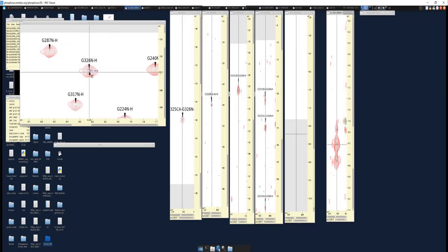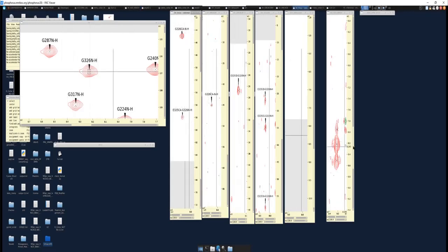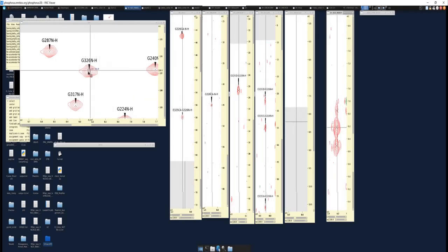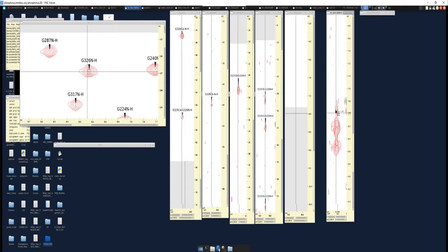So in this scenario, we have a glycine, and we can just see this from the HNCA. And we can see we have 3 peaks in the amide region. We can see one of them, the center one at around 8.2, is the I peak, so the hydrogen that correlates to the peak we're looking at here in the NHSQC. And there are 2 other peaks here. Now, these could be through space, but they also could be the I-1 and I+1 amides. Those are also close.